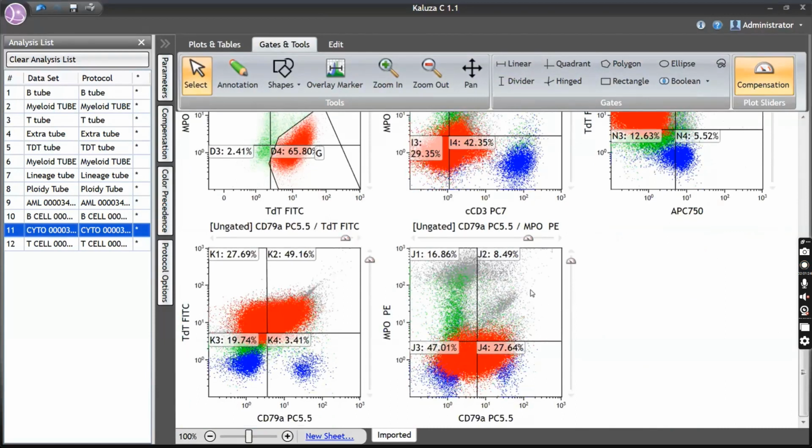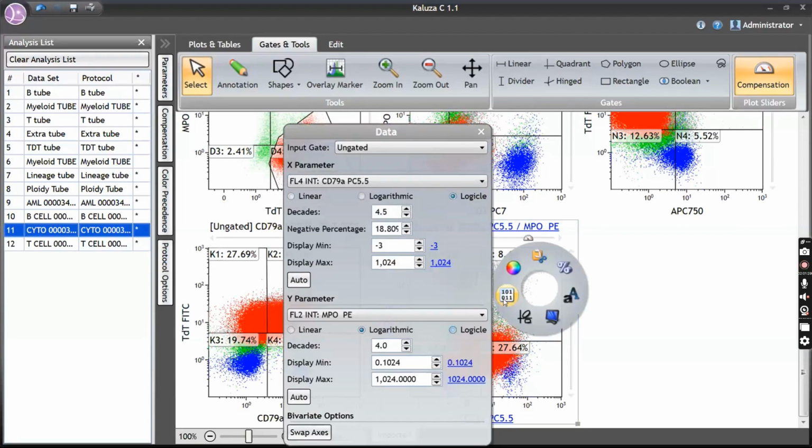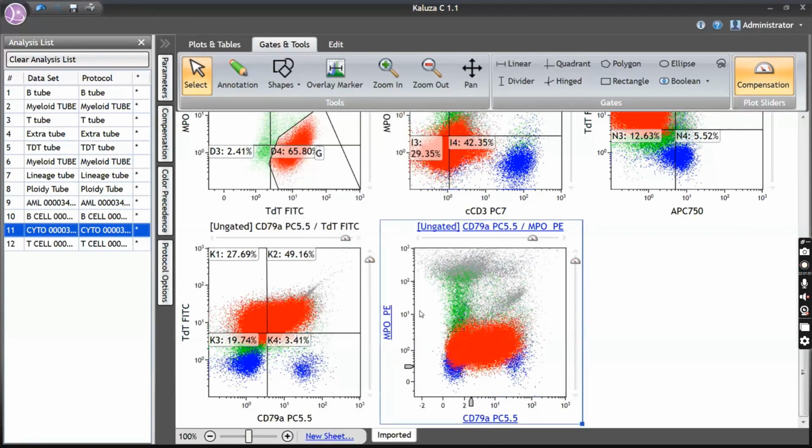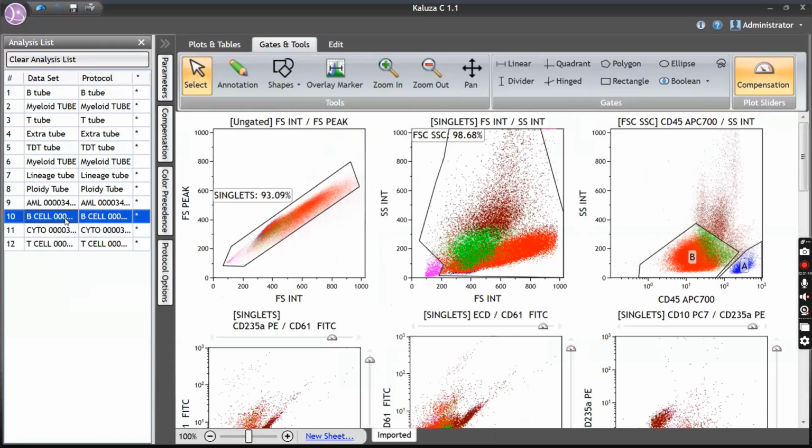So what is the diagnosis? What do you feel to be the diagnosis? Opinions? B-ALL with aberrant myeloid markers. Superb. I too feel that it's a B-ALL with aberrant myeloid markers. I'm not worried about CD117.